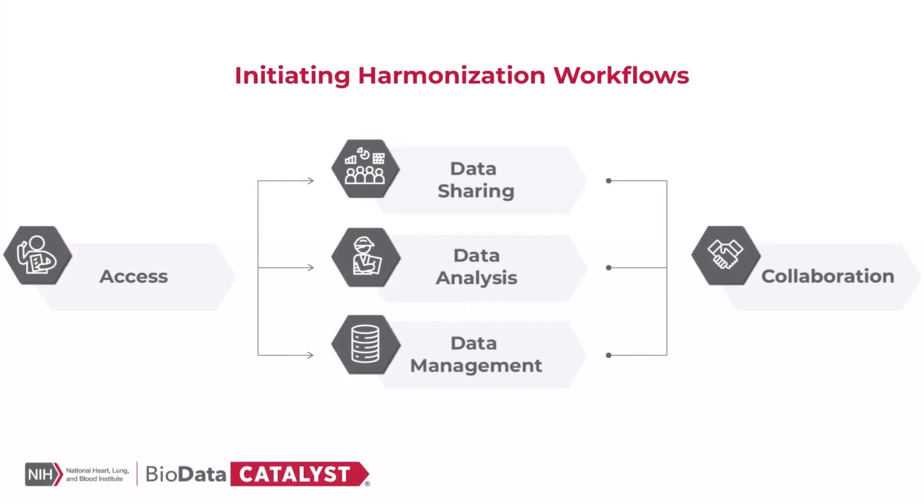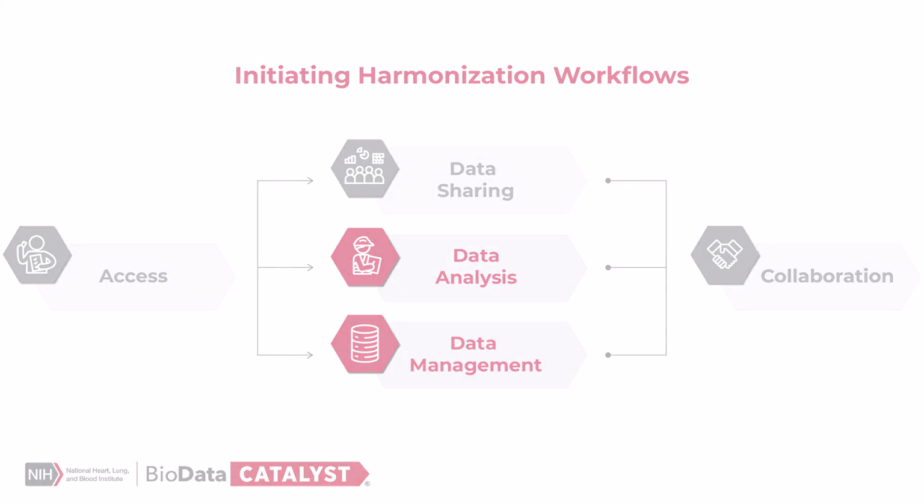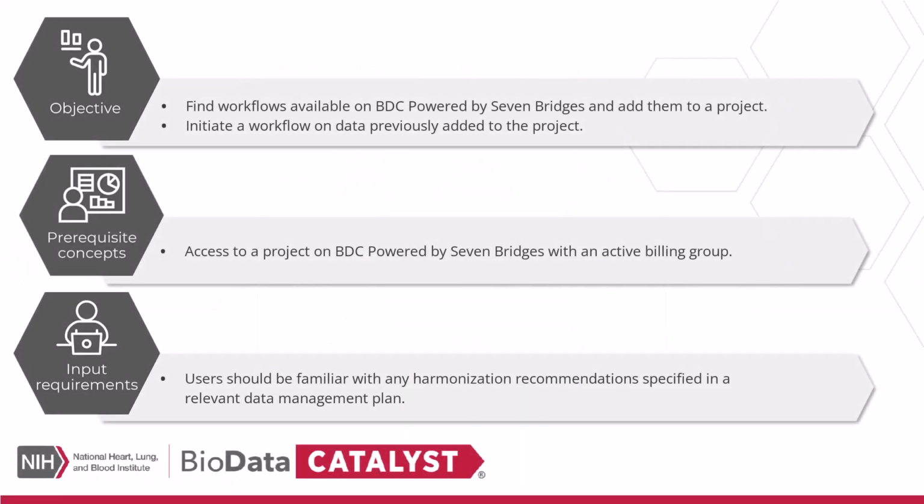Videos in this series span topics across the study and data life cycles. This video will discuss how to initiate workflows to process and harmonize study data using BDC powered by Seven Bridges. After watching this tutorial, you'll understand how to find workflows available on BDC-Seven Bridges, add workflows to a project, and then apply the workflow to data files within the project.